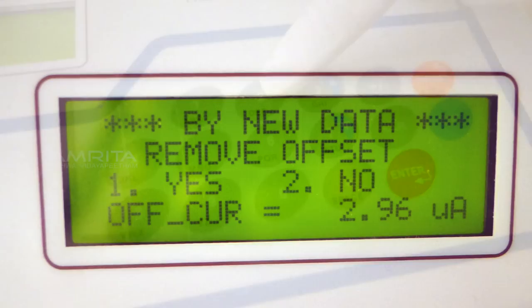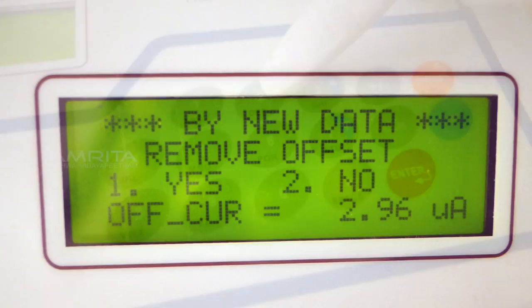If offset is present, remove the offset current by pressing yes. After scanning, choose the print option to generate the corresponding results.